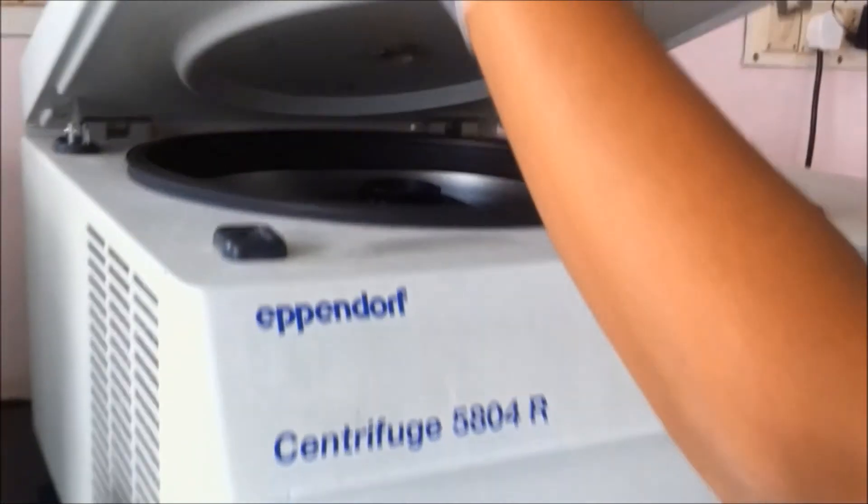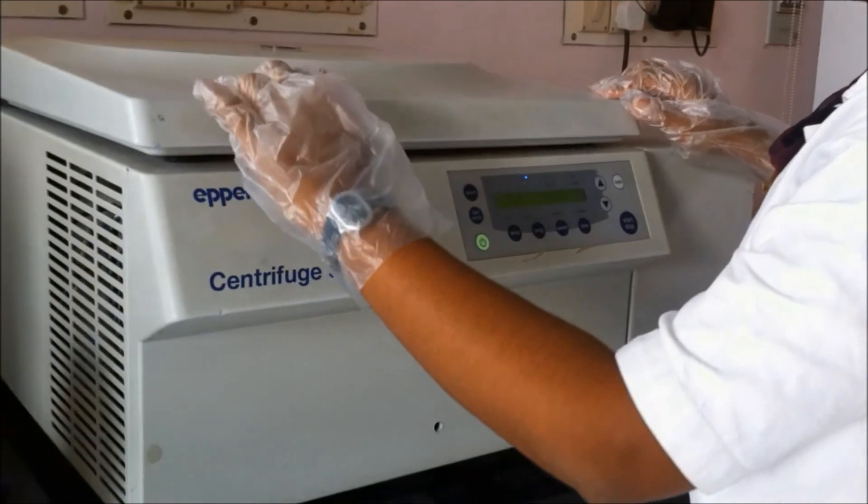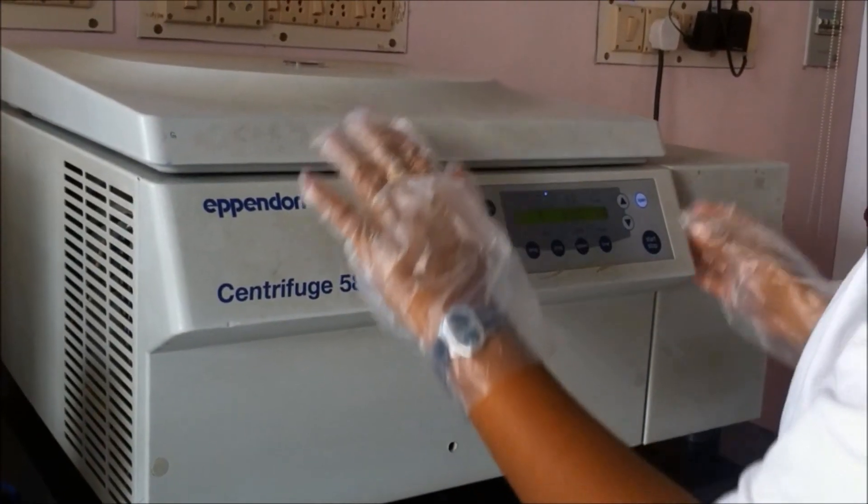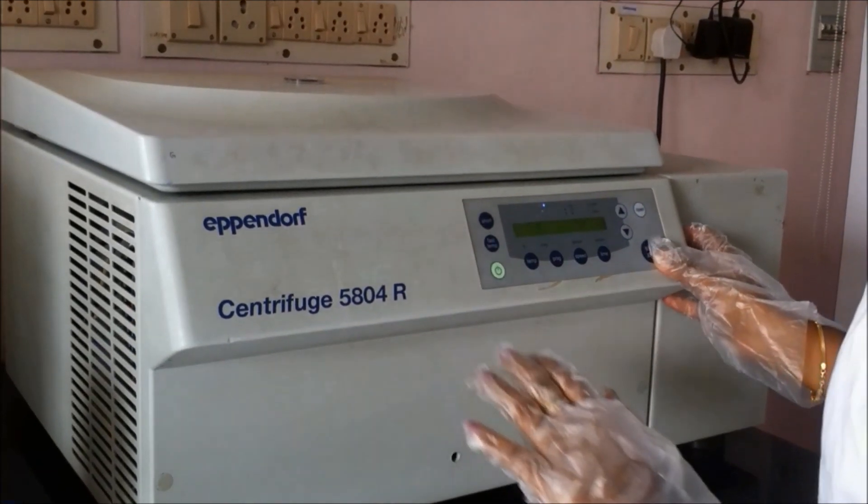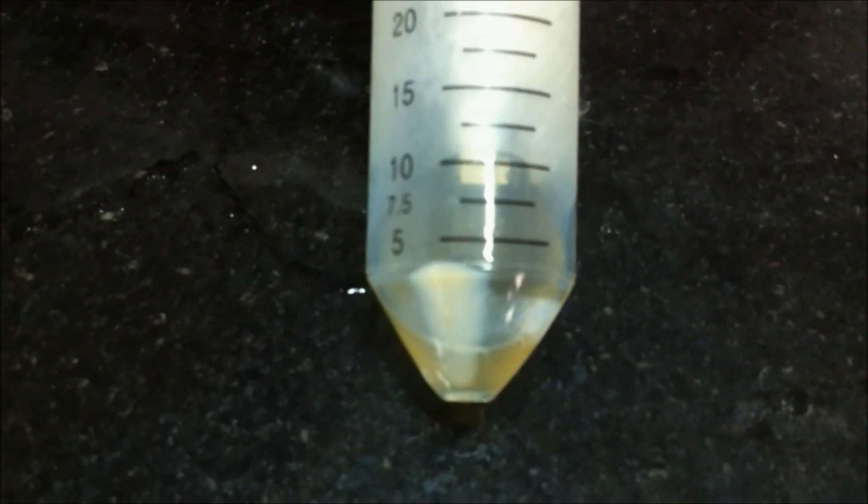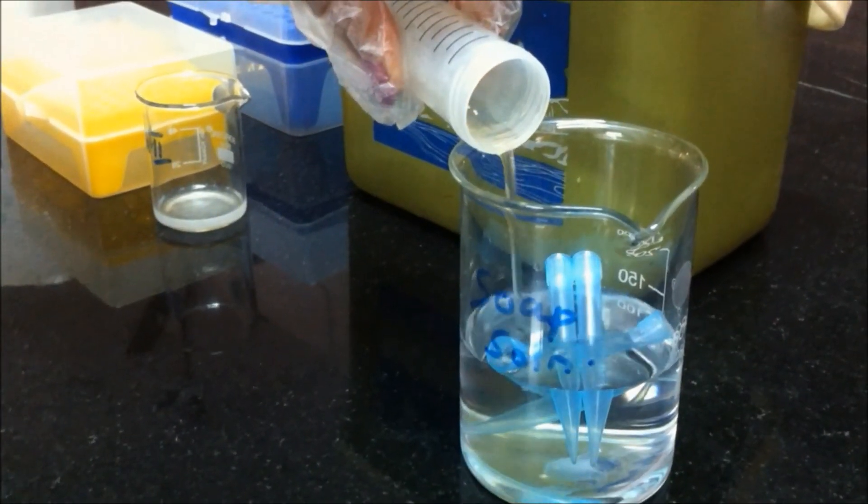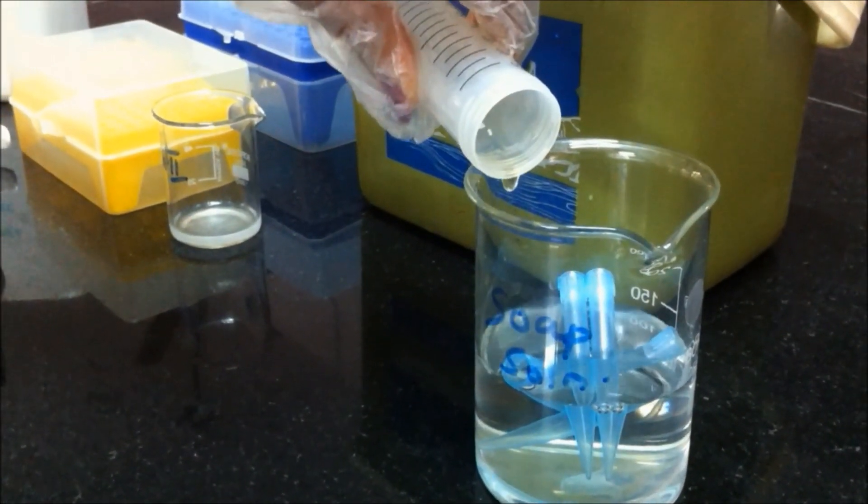If the cells are centrifuged for a long time, it will be more difficult to resuspend the cell pellet. The pellet is formed. Discard the supernatant and retain the pellet.